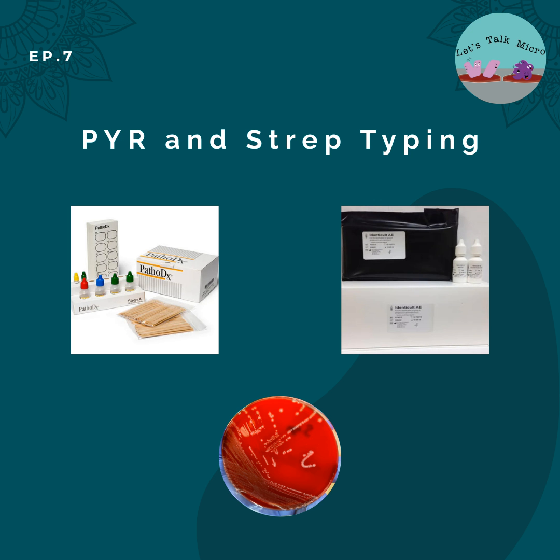So by now you're seeing a little order. You have your colonies on your plate. You do a gram stain, you see clusters or you see chains. You do a catalase, positive staph, negative Strep. Then if you have a staph, do coagulase, positive Staph aureus, negative CNS. If your catalase was negative, PYR, right, positive, look at your hemolysis. If it's alpha and gamma, and this is for gram-positive cocci in chains, alpha and gamma, you have Enterococcus.